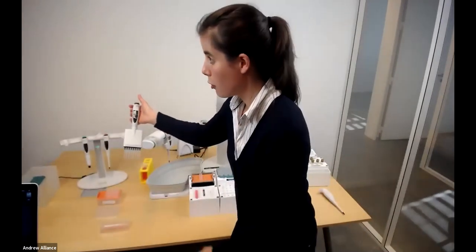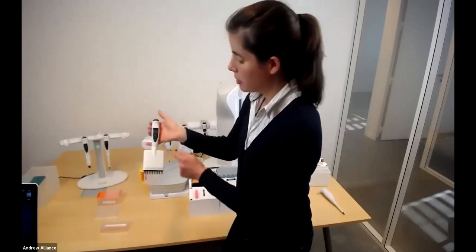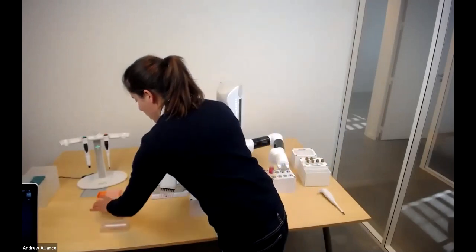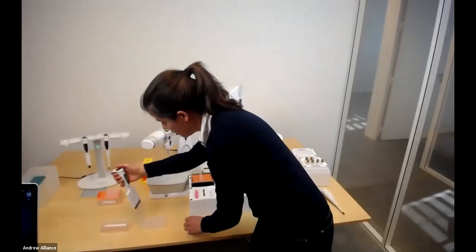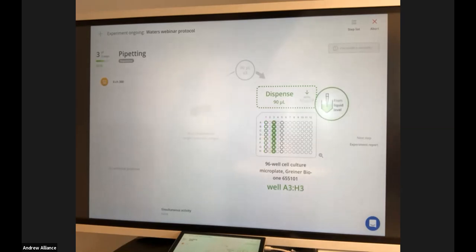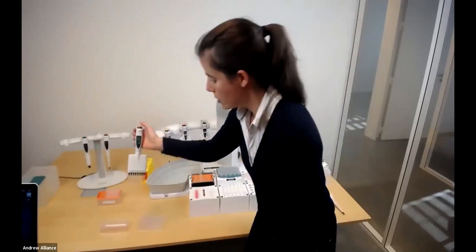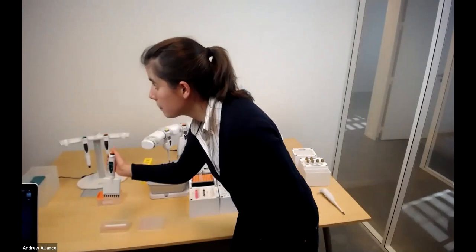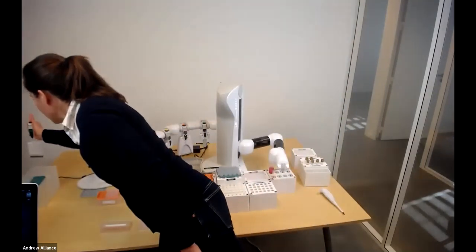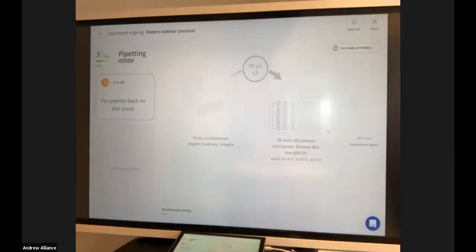There we go. Aspirate from my reservoir, which is right here. It's a big amount, it's 270 because we will repetitively dispense in the microplate. So here you see we go to column 1. So here, column 1, simple click. Now it says 180, meaning there's 90 in column 1. You go to column 3. And then we go to column 5 as well. Purge the tip, so we're going to remove the excess into our reservoir. One simple click. And we're going to eject the tip back in the waste. And I'm going to put the pipette back on the stand.